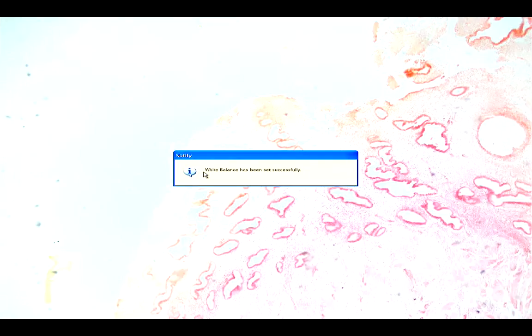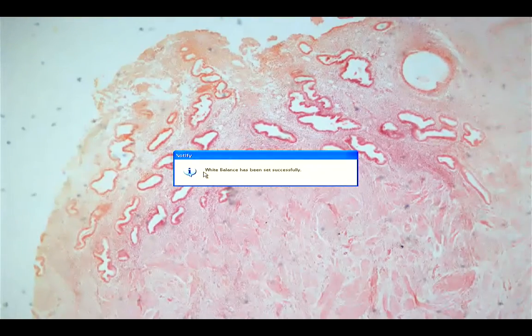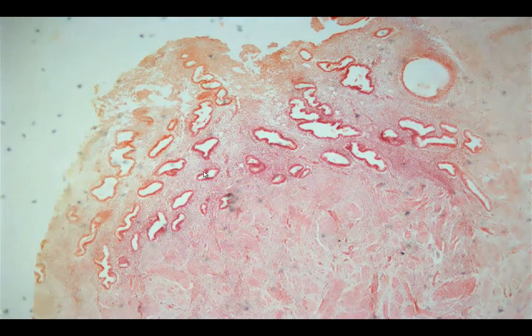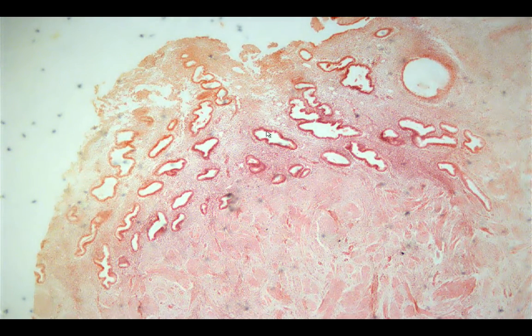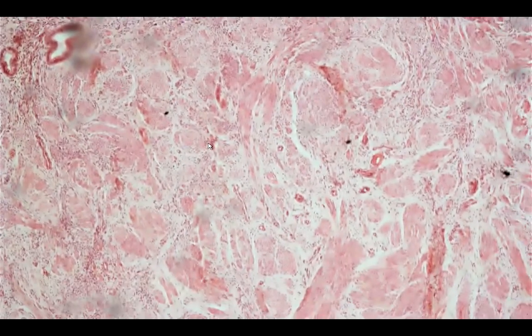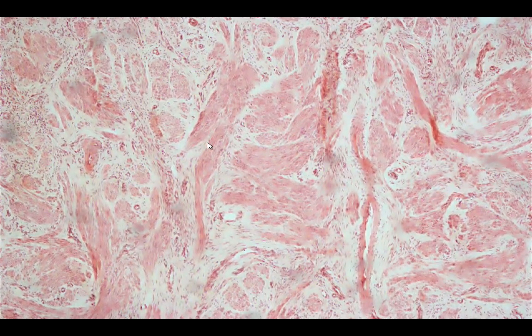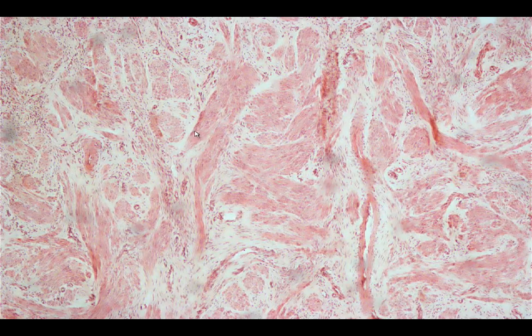over here. So the uterus is coming from the female genital tract, and to be able to identify it, we first look at the layers, which the innermost layer would be called the endometrium. It possesses these glands. Okay, those are the glands. And then in the myometrium, the second layer, you can see the presence of the smooth muscle fibers seen in alternating fascicles. Okay, that would be circular, longitudinal.